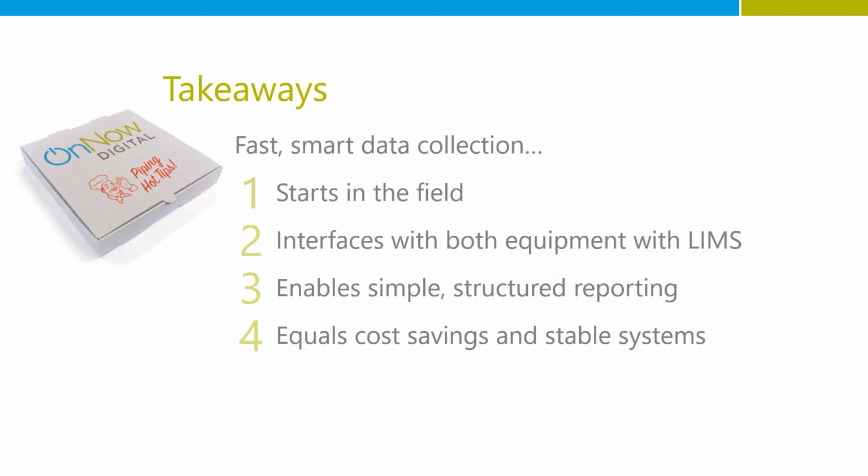Some takeaways here just before we leave. Again, thanks so much to Brett and Bill for jumping on and leveraging some of their expertise for us. The takeaways for today's session: gathering the proper data starts in the field. Hopefully after it starts in the field, you can register that information and interface and interact with your instruments appropriately and connect that with your LIMS system. Third, that's going to enable simple, structured reporting for the future.